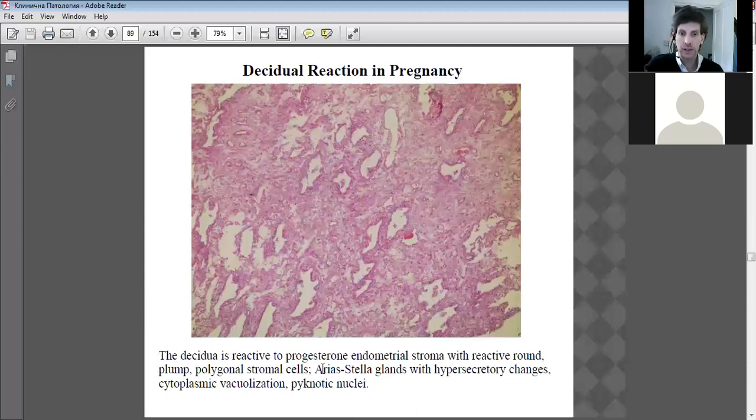Okay, and the glands, glandular tissue. You can find some examples up here, glandular tissue there. So these are the glandular tissues that if you're asked in the exam, these are the glandular areas here. Producing lots of secretions to help with the mucus, for example, will help with the stretching and growth of the uterus.